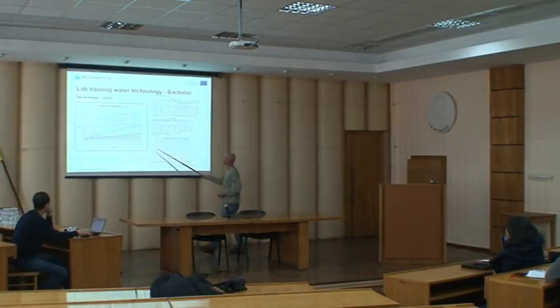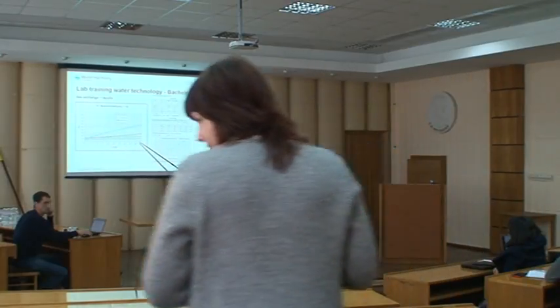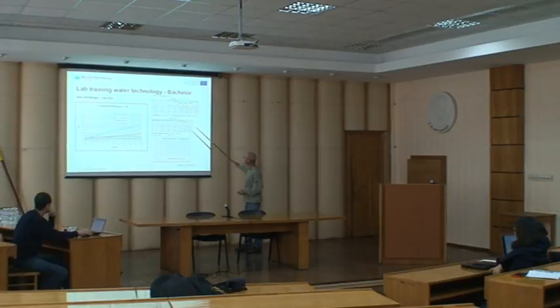So this is the result from one experiment which is not shown on the previous slide, but you can see here, what is it in English? The different HTU, NTU for the dimensioning of columns.